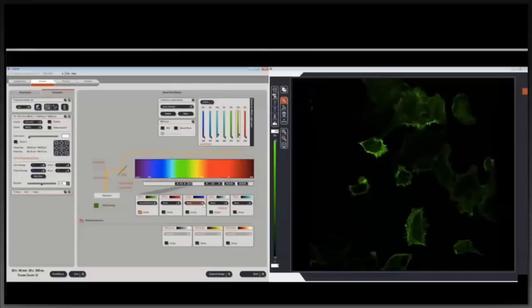A few things with this. First of all, I'm going to get the spectrum up for the emission. And this is for Alexa 568, but it will be similar to cherry. So I can think about where I want my emission band to be. So if I activate my PMT, I'm just going to move it so it covers a nice peak there.